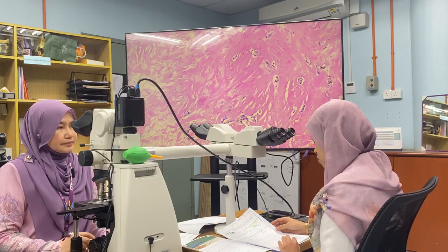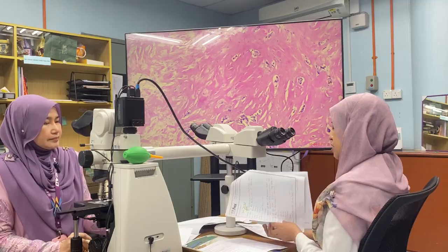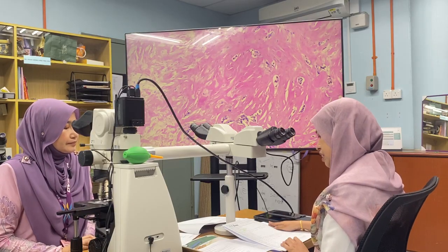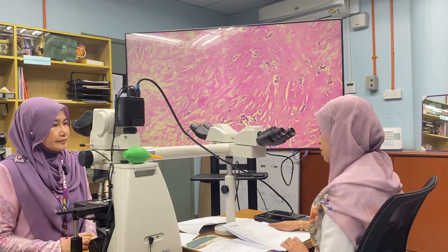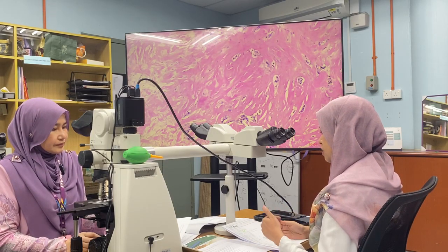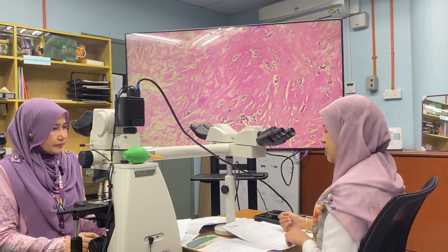On cut section there is a presence of whitish lesion measuring 40 x 30 x 15. The distance of the lesion to the margin is as follows: 75 to superior, 20 to inferior, medial 25, lateral 110, and less than 1 mm to the superficial, and deep 14 mm. Also, upon serial cut section, there's another fibrotic tissue on the outer upper quadrant, measuring 15 x 10, and the second lesion is 10 mm from the first lesion.